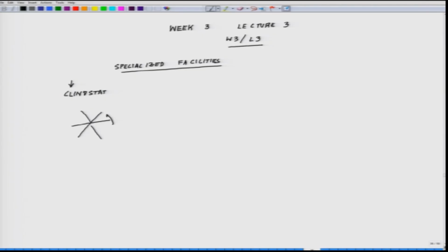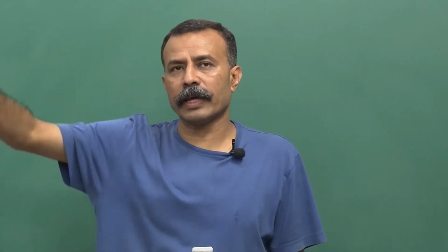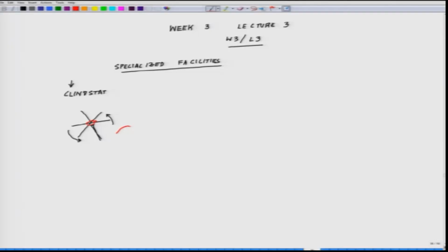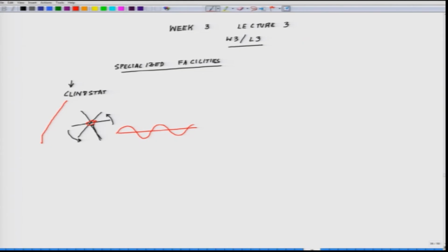This is a very interesting setup which rotates like this at a particular RPM, and you have your sample kept somewhere out here. So the cells experience a change in gravity like this. The gravity value changes. Panasonic in Japan makes these kinds of devices, and if you have quality engineers around you, they can develop it for you. There are designs available online to make these devices.